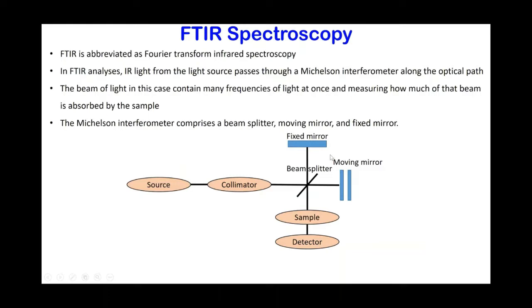Here, some fraction of the original light passes into the sample compartment, and this light is used to focus on the sample. Once the light leaves the sample compartment, it is refocused on the detector.